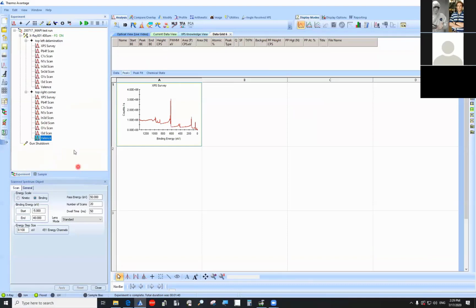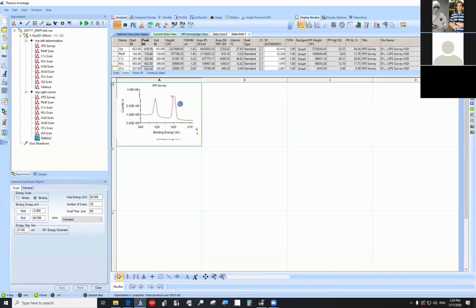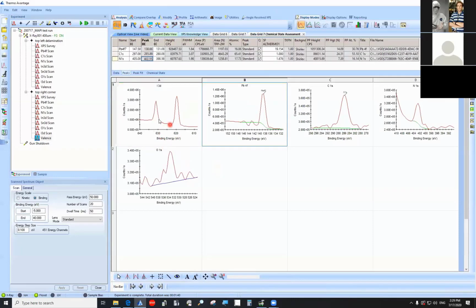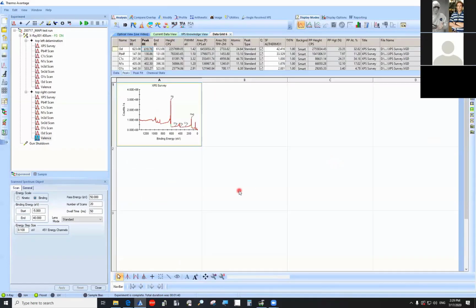Okay, so within this XPS survey spectra, once you have this highlighted, you can go up here to some of your analysis tools. And for instance, you could just do the generic, hey, computer, find all the peaks for me. Bonk. So it's going to click this thing and dump it out for us. It will then take a look at trying to fit each one of these individual species. So it's doing its best to put in what it thinks is a reasonable looking baseline, and then show you that. And from that, it will dump out a series of peaks that you see here.